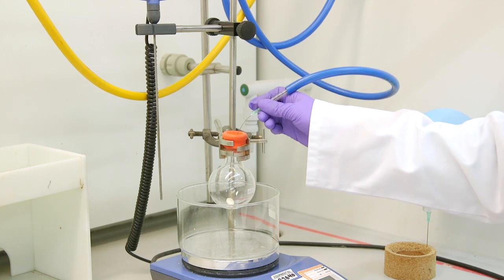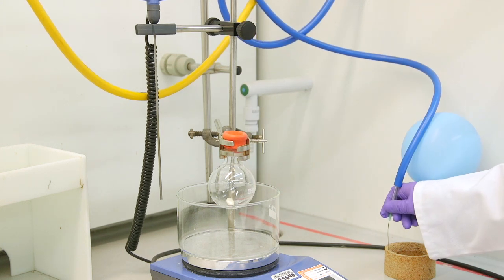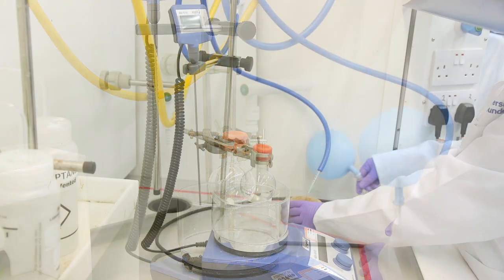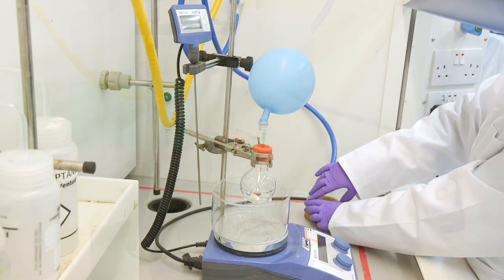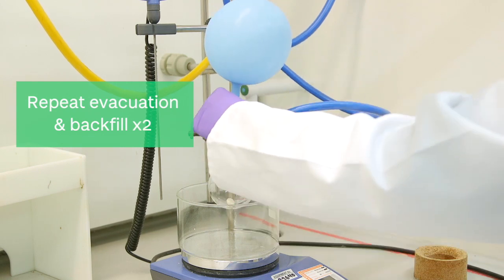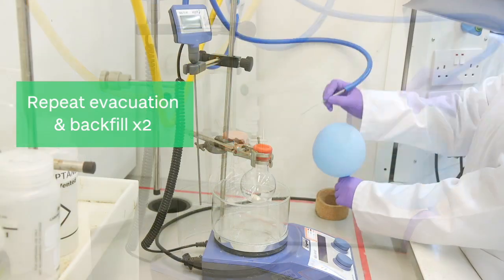Now we are going to remove the vacuum line and replace this with our nitrogen balloon. You may notice you hear a rush of air entering the flask and the balloon size decreasing. We will repeat this step of evacuating and backfilling two more times.